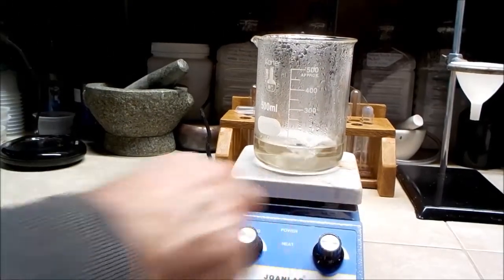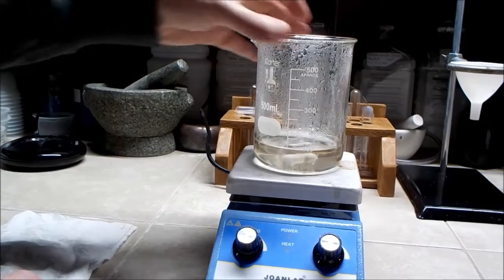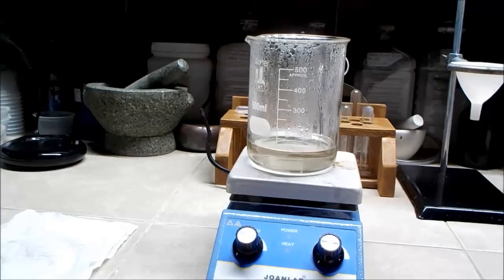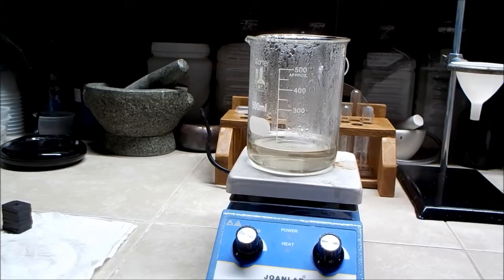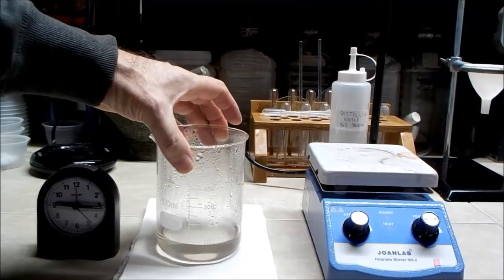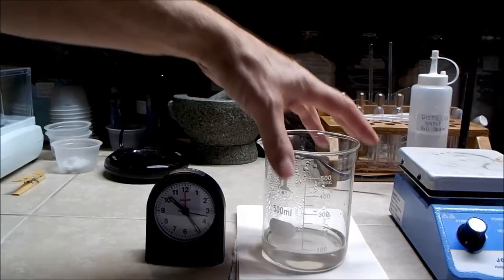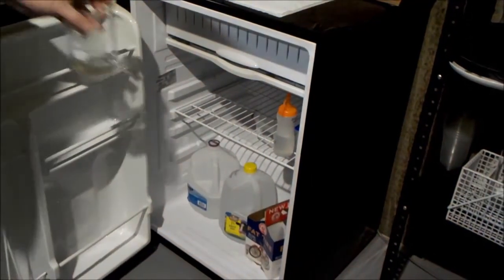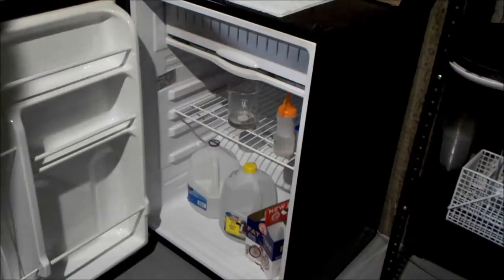Much of the water has been removed and I have a little under 100 milliliters of solution remaining. I had intended to stop a little sooner — perhaps at 125 or 150 milliliters — but time got away from me and I overshot the mark a little. I remove the beaker from the hot plate and set it aside to cool. A little over an hour later it cooled to room temperature, but no crystals have yet formed. I decide to place the beaker in the refrigerator and let it set overnight. The next day I remove the beaker, and to my disappointment, no crystals have formed.